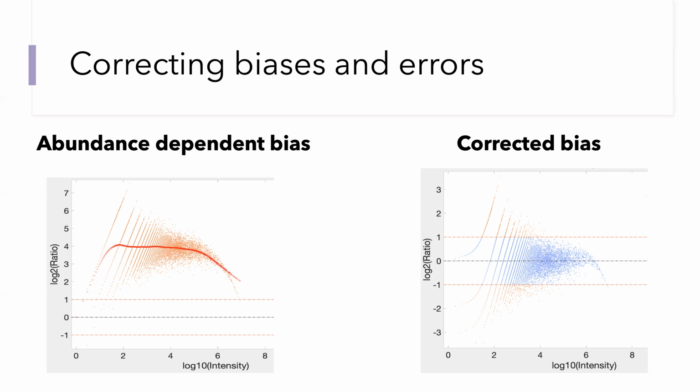Another example of a systematic bias that is commonly removed from proteomics data are biases that depend on the retention time of peptides. We can have the relative ratios of peptides be a function of the retention time, the order in which peptides elute from the chromatographic column. And because we don't expect that this necessarily should be the case, it is sometimes corrected. And the same measure of moderation and caution should go into performing corrections of biases correlated to retention times.